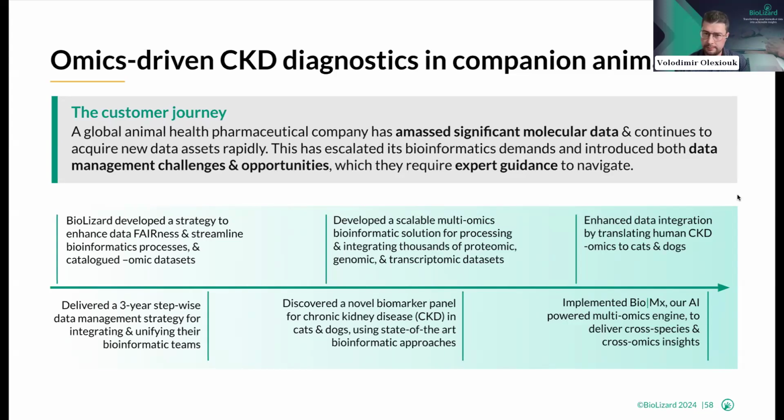And this brought some very interesting results, whereby we did see that part of the variability that we could not place somewhere, and that puzzled the scientists, can be attributed to working with bulk samples.